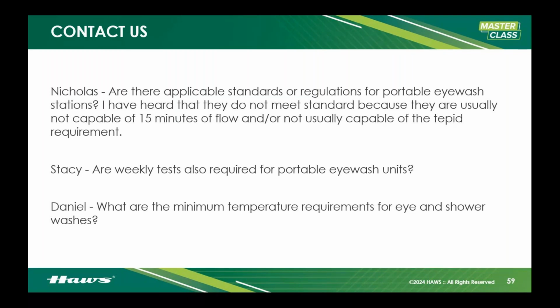And then Stacy asks, are weekly tests also required for portable eyewash stations? And they are. But remember that it is just a visual inspection of the emergency equipment. That's all. There's no need to actually activate it except for your annual inspection. On an annual basis, you are required to run that portable for the full 15 minutes. I just pop it, let it run out to the ground, refill it, and you're good to go.